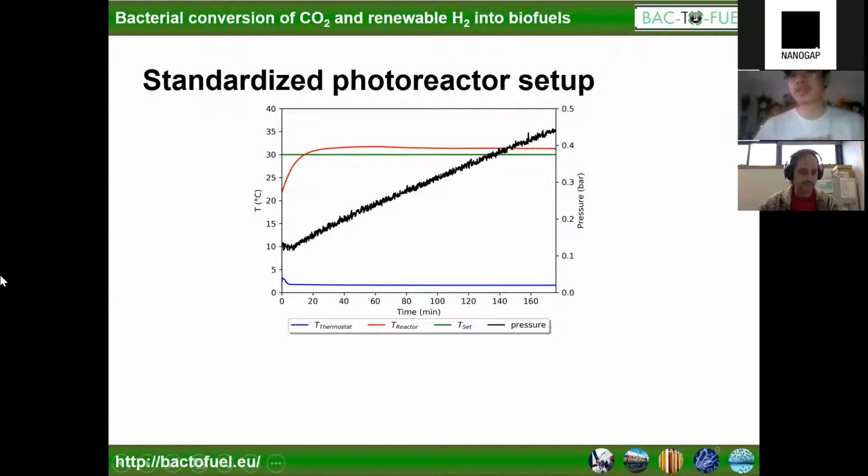In this kind of experiments, we couldn't go below this cooling temperature because then our cooling fluid, or the water, would be frozen, and you couldn't cool the system anymore. So this was the temperature we got after the 40 minutes for our reaction.